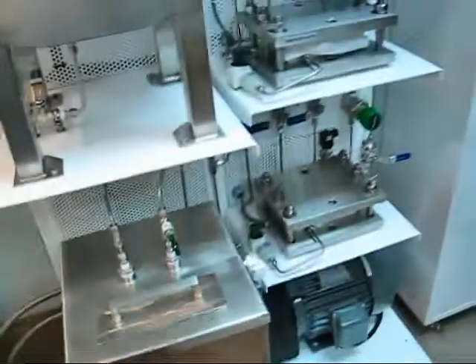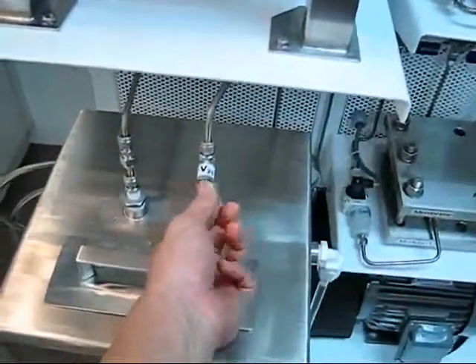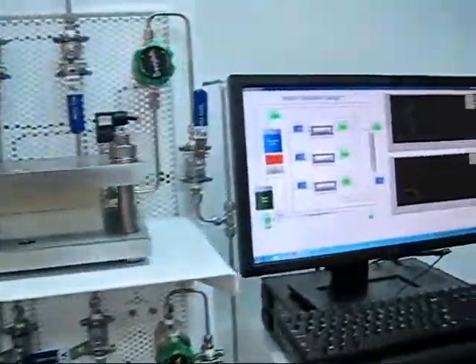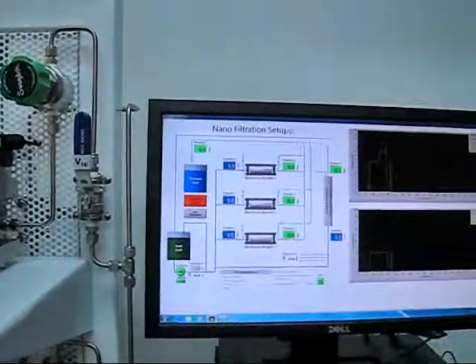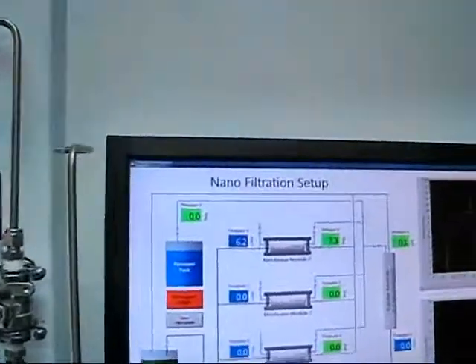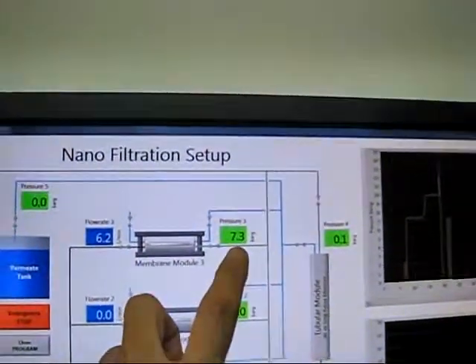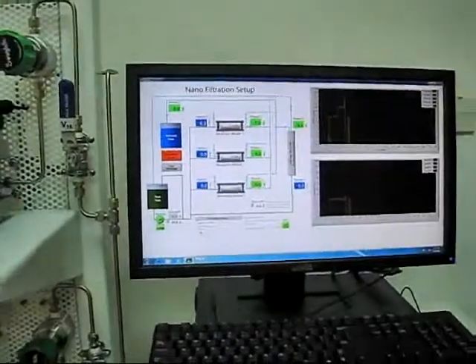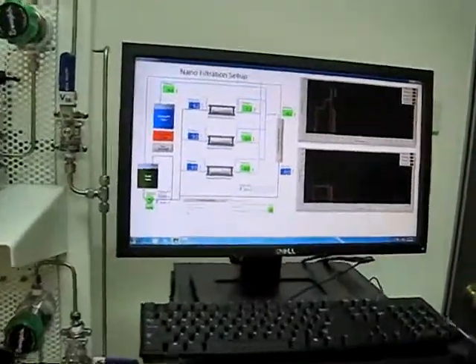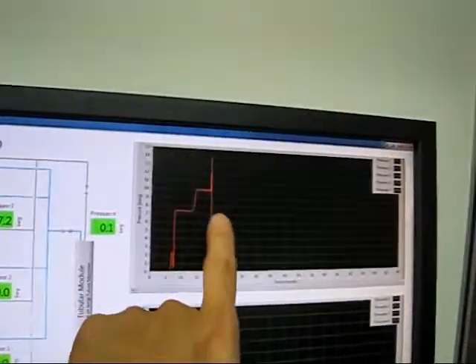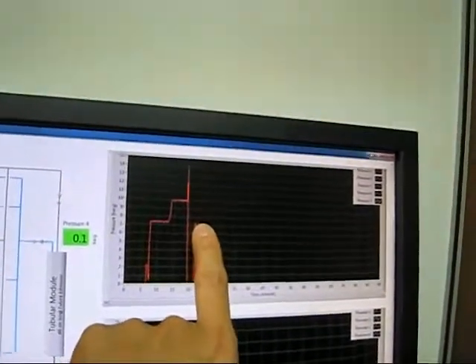We should be quite safe right now. I will channel all the flow into the system. I should get a feed flow rate of about 6.2 with a pressure of 7.2. We're getting this number right now. You'll see a lot of fluctuation on the graph—it's normal. We had no flow and then we have flow back again, and the pressure is now going back to previous values.